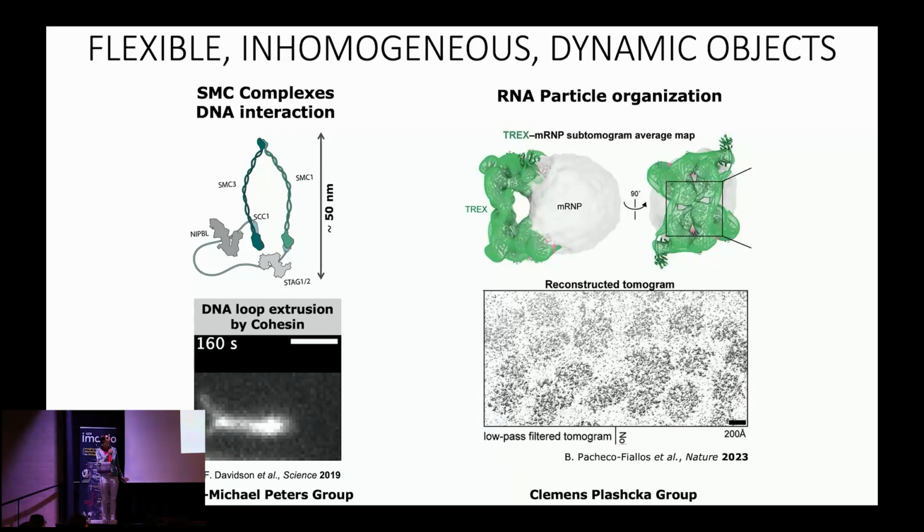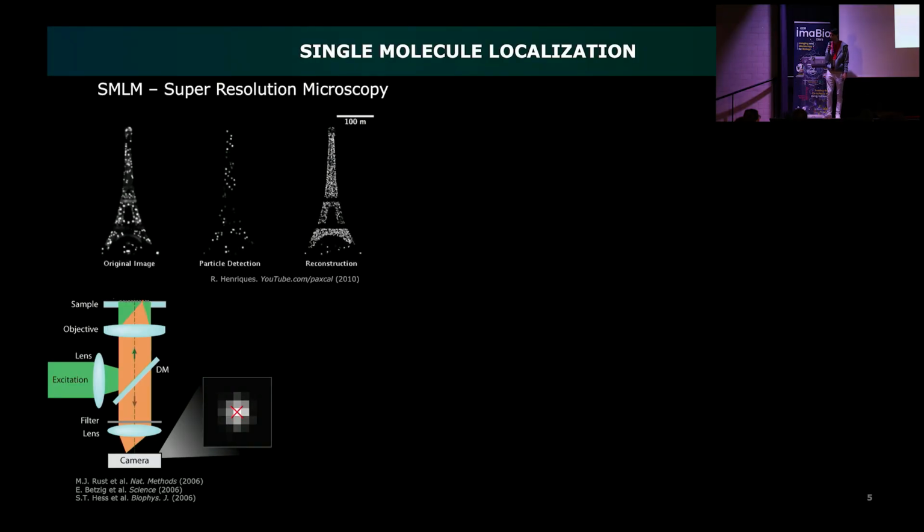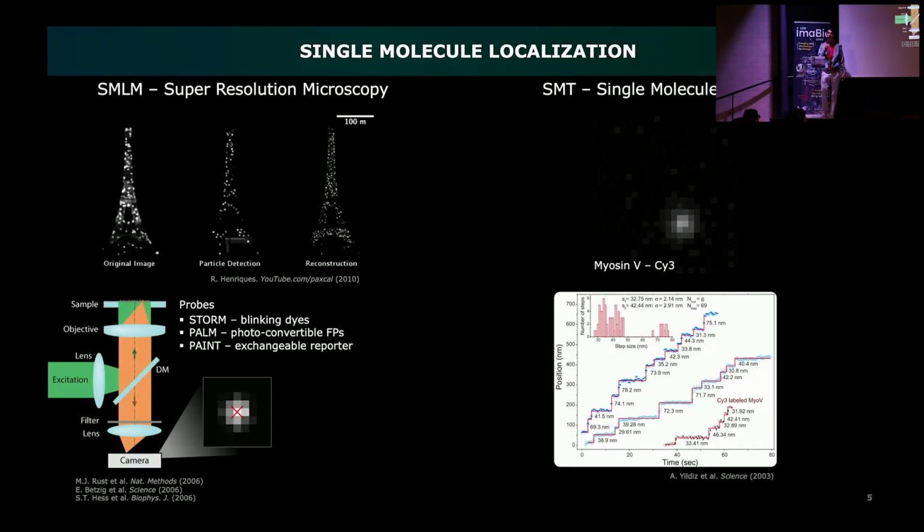And in my lab, we're pursuing this type of goals, looking at conformational changes of proteins, as well as flexible objects like nucleic acids. Jörg introduced all the relevant aspects of SMLM, but I want to say a bunch of things, because one of the challenges in the single molecule localization techniques is the precision that you can get, how many photons you need for that. And what I'm going to talk about is MINFLUX localization, which attacks that problem.